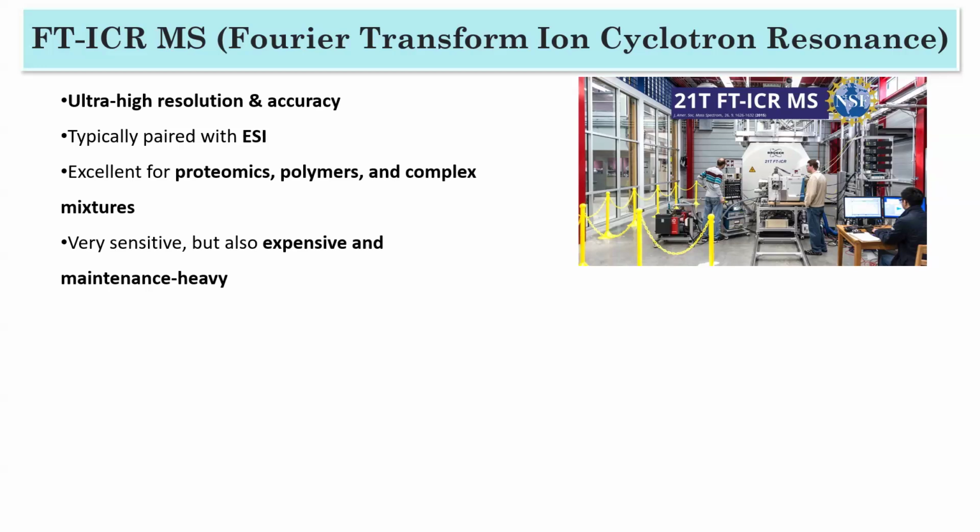Okay, so the laser has some particular energy, and that energy can be used by the matrix. Your matrix molecule can be excited by that laser light. So that's why you need a matrix. Suppose you have some protein and you are not sure what kind of laser to use. If you can mix it with some matrix, and that matrix can get excited and ionized first, and then help ionize your protein or some biomolecule, then it becomes easy, right? If there is any other question, please let me know.